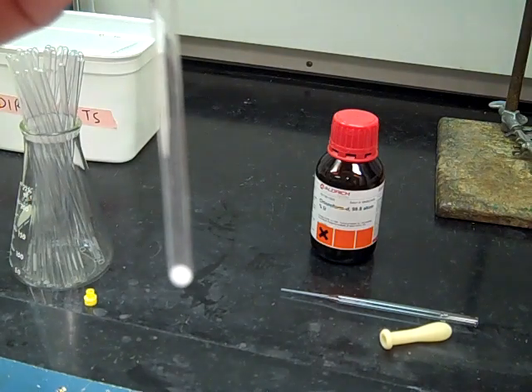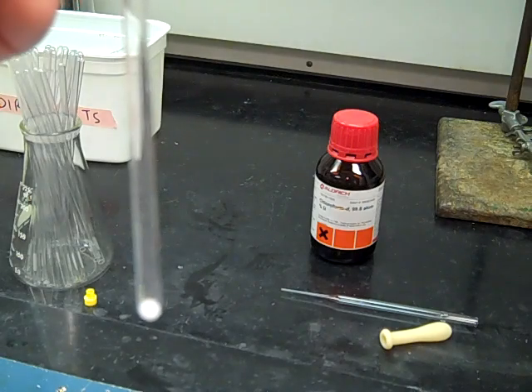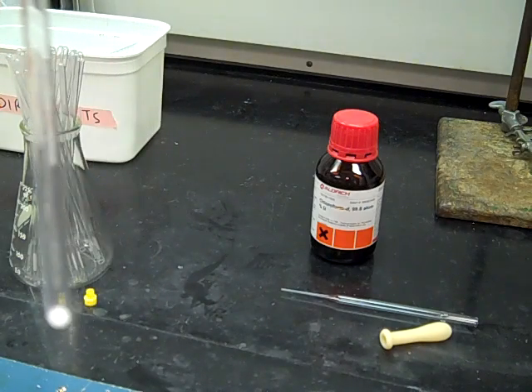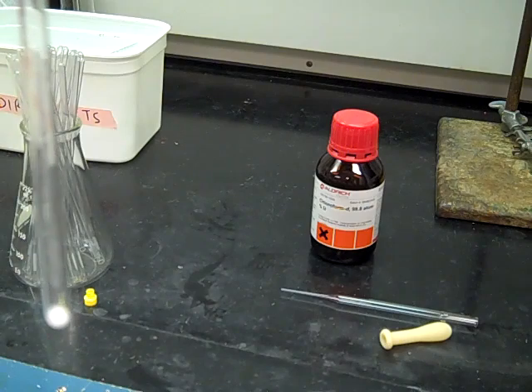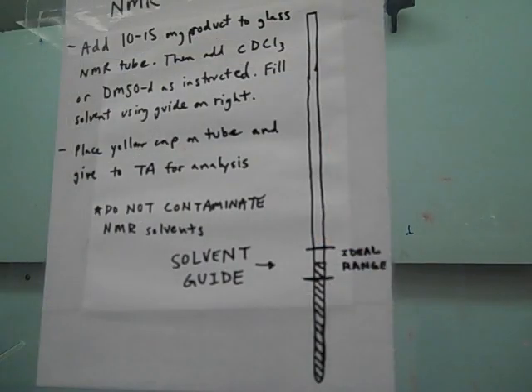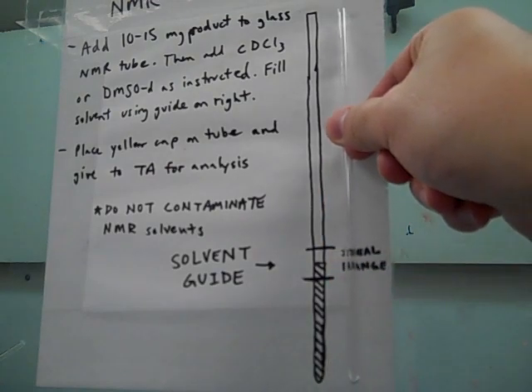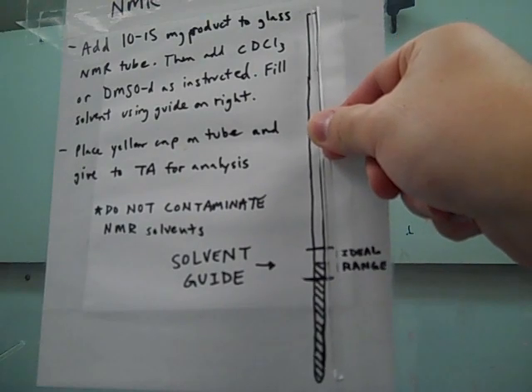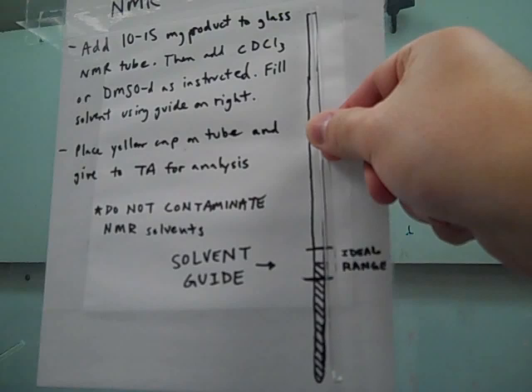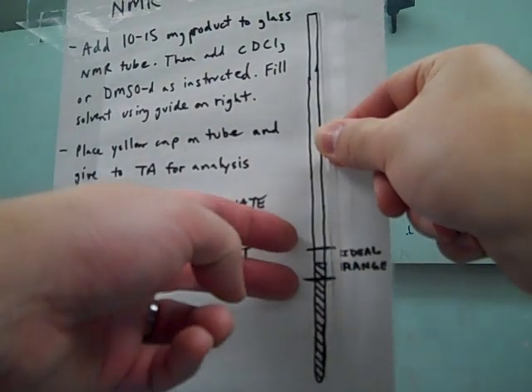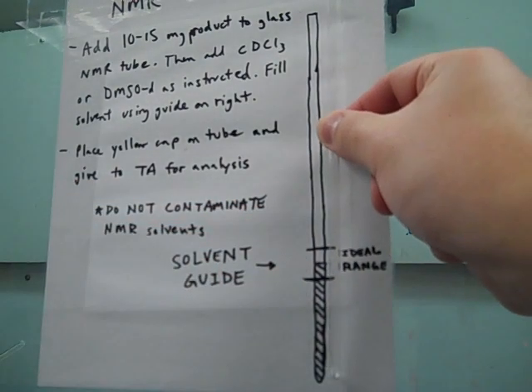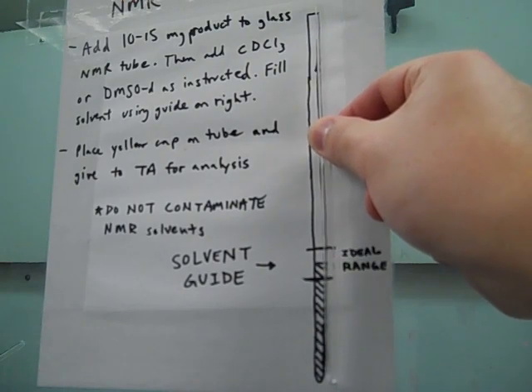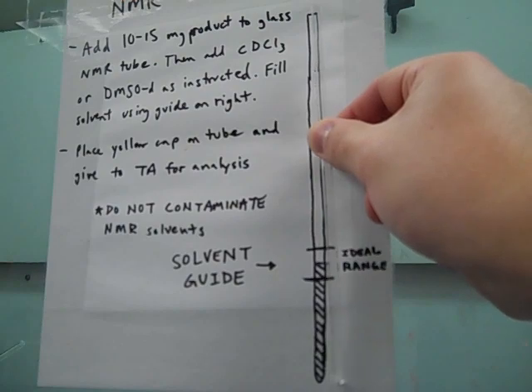So once you've got your sample in there, you're going to need to add your solvent. To know how much solvent you need to add, you're going to refer to the solvent guide that's actually on the front of the hood. So this is the solvent guide that I was referring to. You can see there's a drawing that exactly matches the length of your tube. You can't see the tube too well, it blends in. But the crossed lines show the ideal range for your solvent. So you want to add just enough deuterated chloroform so that you can make it somewhere in between that ideal solvent range that you see on this guide.